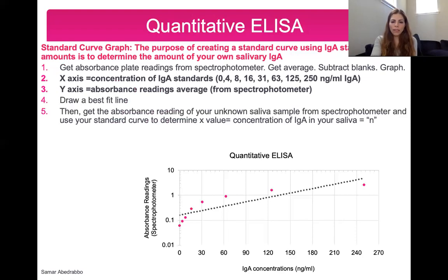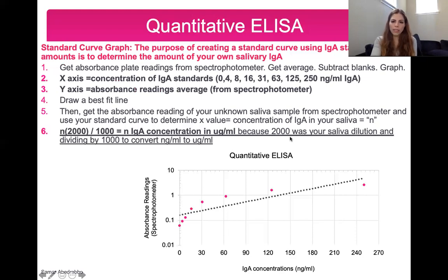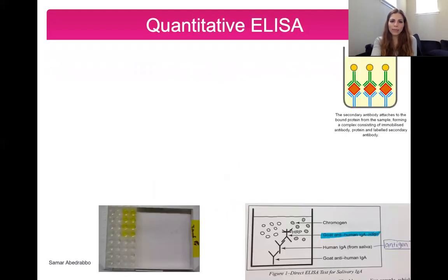You draw a best fit line, and then you get your own saliva sample, and then you do some calculations, which I'm going to skip because you guys unfortunately are not actually doing this experiment.